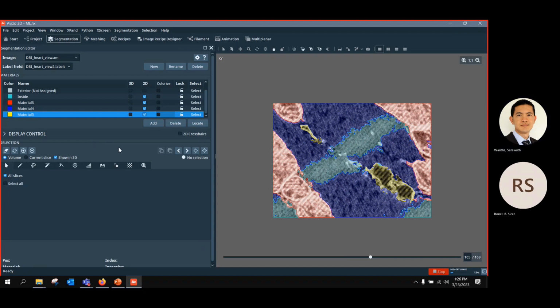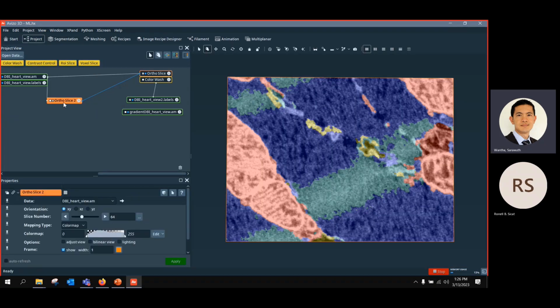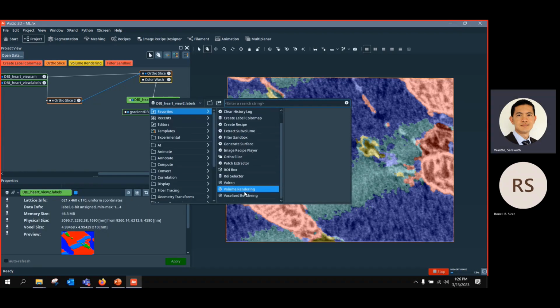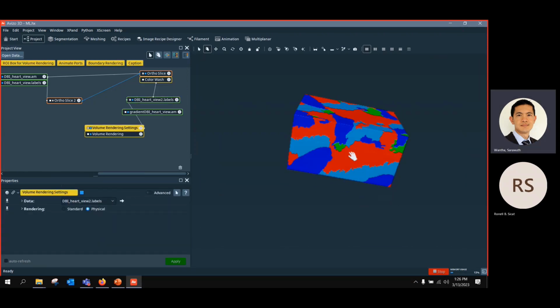Use models as ground truth for the deep learning. I think that's possible. Yes. Because it's the same segmentation, so you need to just generate this label image. So if you look at this result itself, this one in volume rendering, actually you get this object like this.